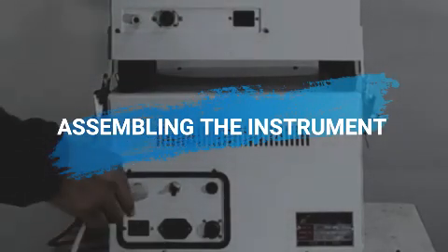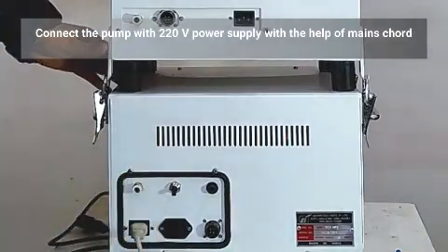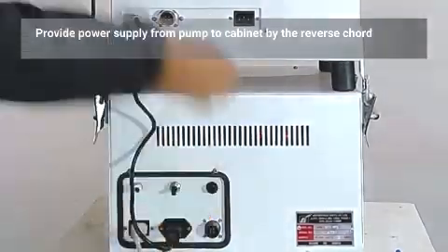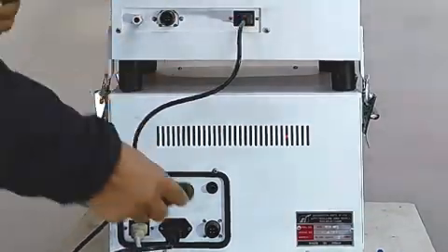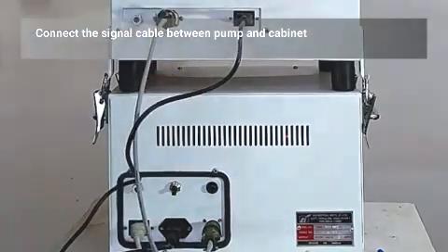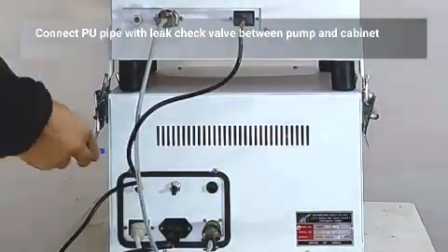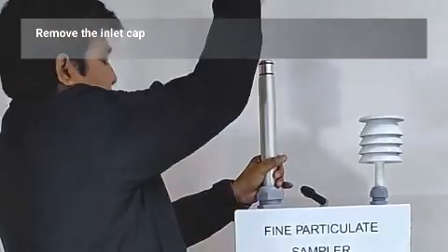For assembling the instrument, connect the pump with the 220 volt power supply with the help of the mains cord. Provide power supply from the pump to the cabinet by the reverse cord. Connect the signal cable between the pump and the cabinet. Connect the PU pipe with leak check valve between the pump and the cabinet. Remove the inlet cap.